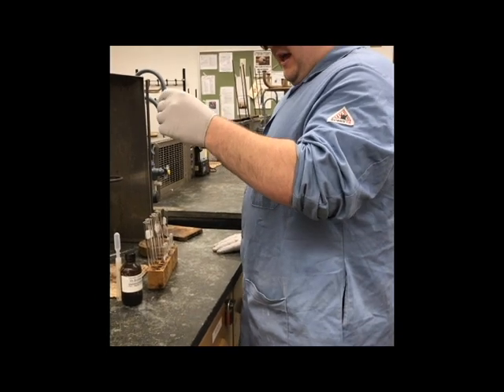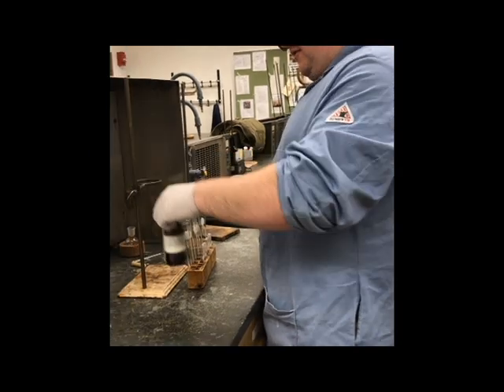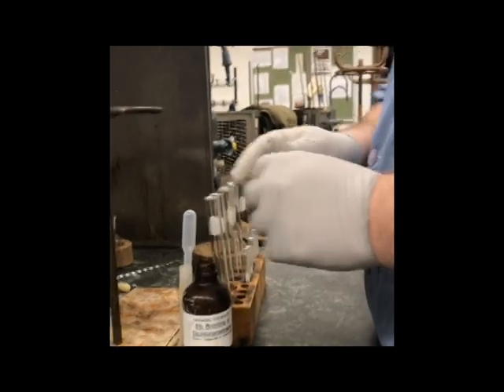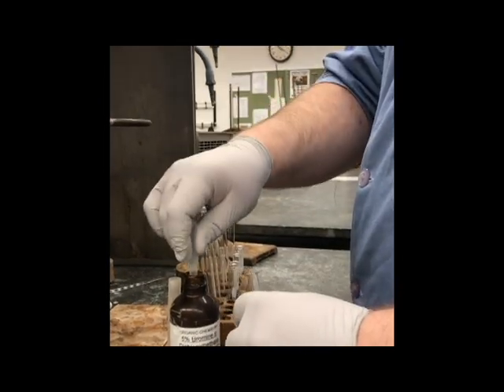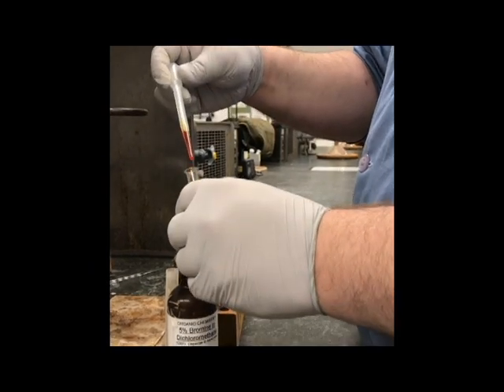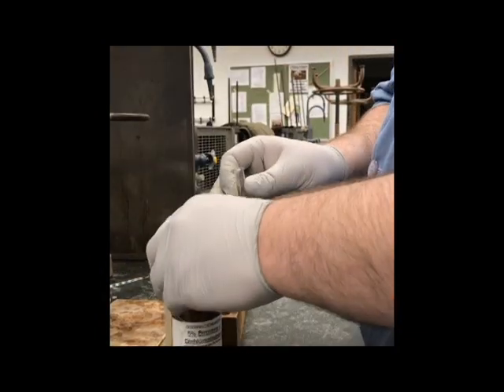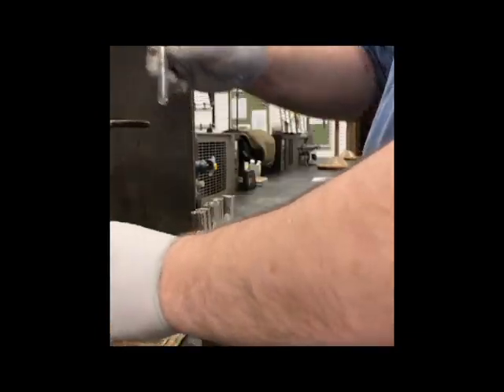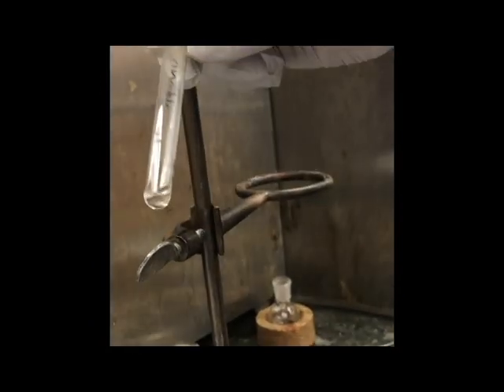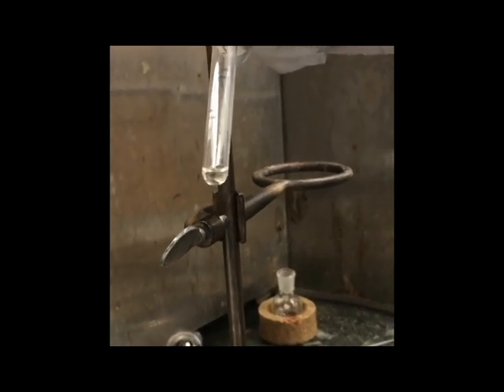In this vial here, we have several drops of our product. In this vial here, we have our bromine mixture dissolved in DCM. So what we're going to do is take several drops of this out. You'll notice how it's a nice dark red color. I'm going to put several drops into there. Close this up, because it's very unfriendly to work with. And you'll see, even though we've added several drops of our bromine mixture, we still have a completely crystal clear, not orange, solution, indicating that we have an alkene present.